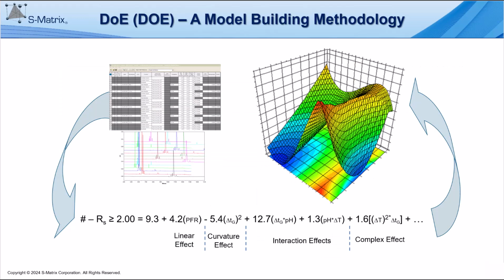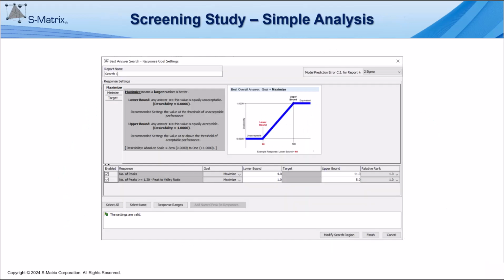With one click, Fusion QbD instantly models all imported results and can use the models to predict method performance throughout the study region, including excellent visualization graphics. To identify the best performing method overall, the user defines a minimum performance threshold for each response. The numerical search engine then uses the models to search through every possible method to identify the one which has the best overall result for all included responses simultaneously.